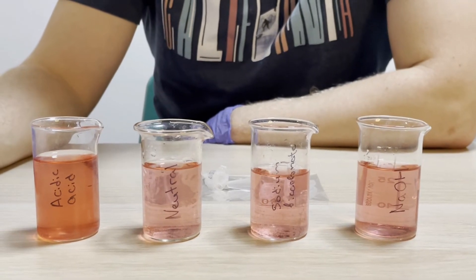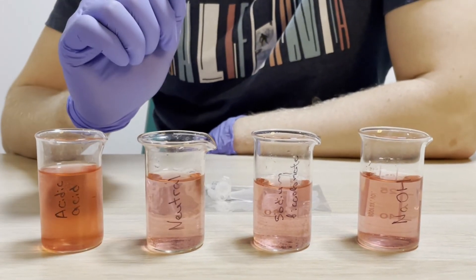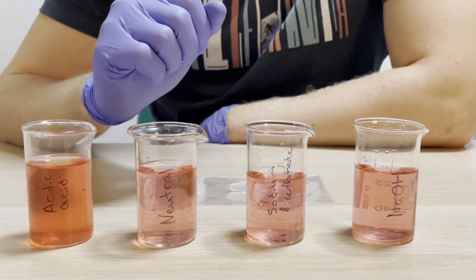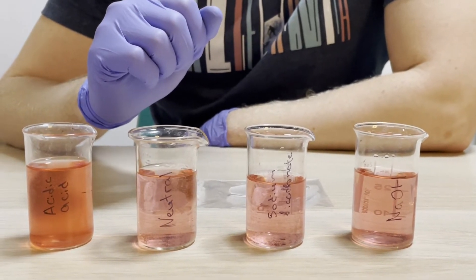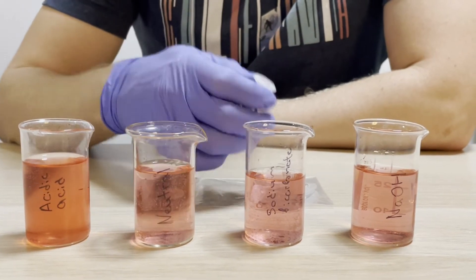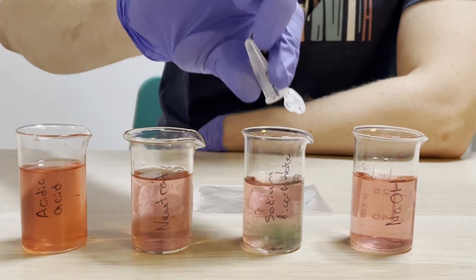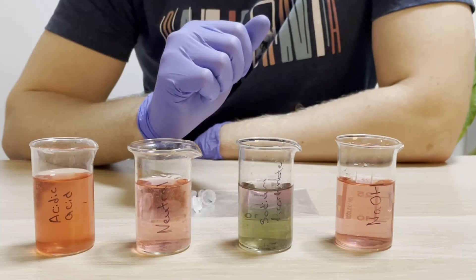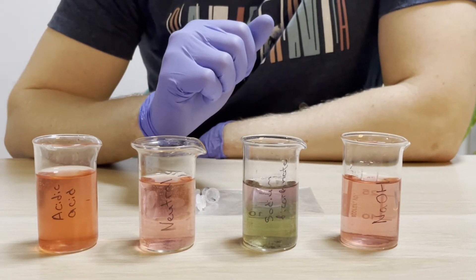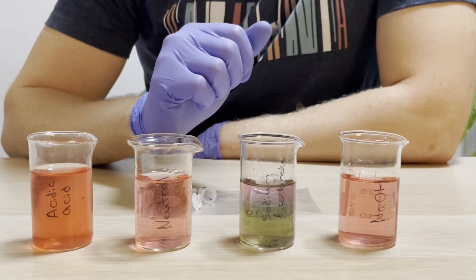In the second beaker we will not add anything and it will stay as a control with a natural pH level. To the next one we will add a bit of sodium bicarbonate to make the pH more basic. And to the last one let's put sodium hydroxide, which will change the pH to very basic.